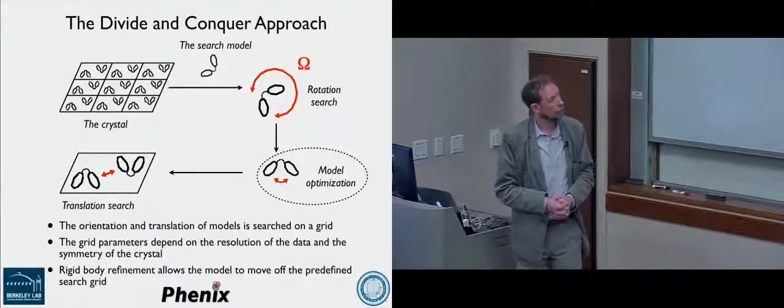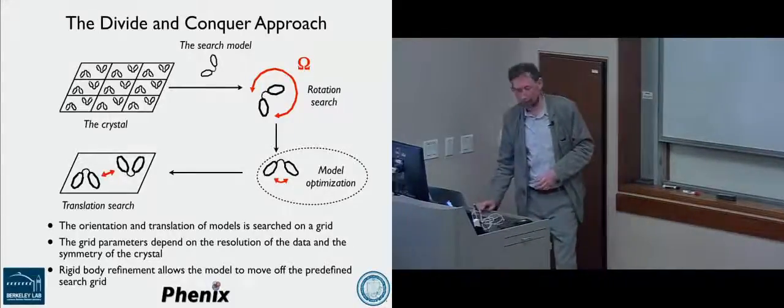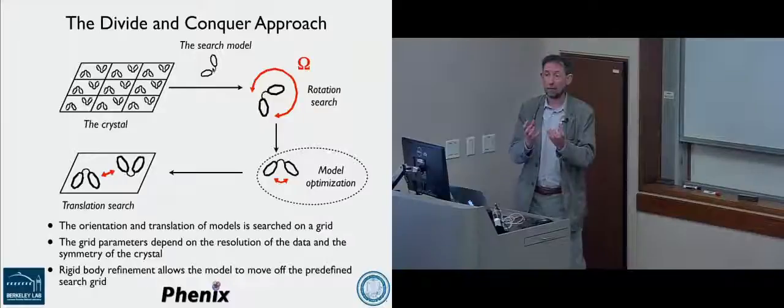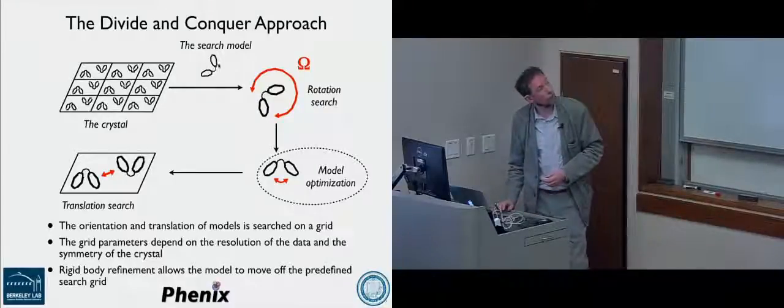But just to quickly remind folks of the idea that what we're trying to do is we've got a crystal with molecules in it, and we've got a molecule, a model that we believe is similar to what's in the crystal, and we're going to try and place this search molecule in the crystal. That's the goal of molecular replacement.